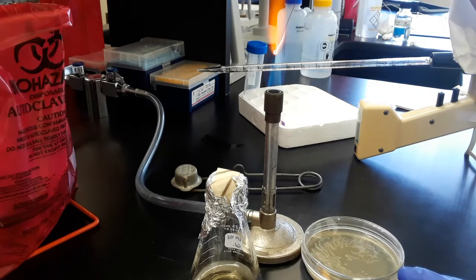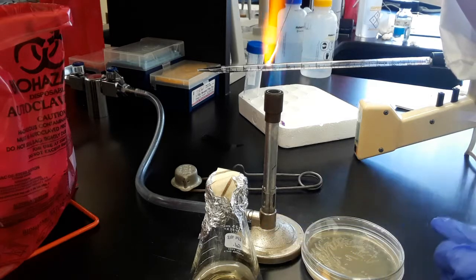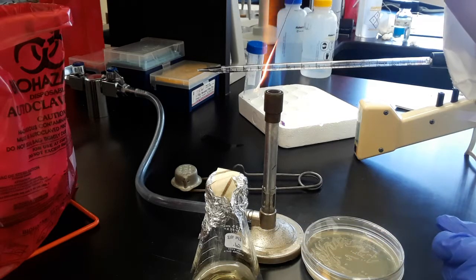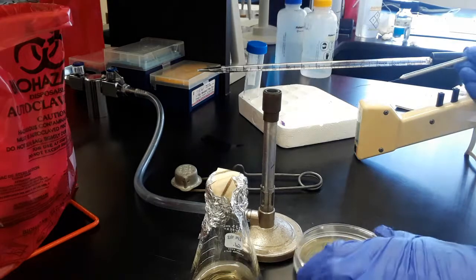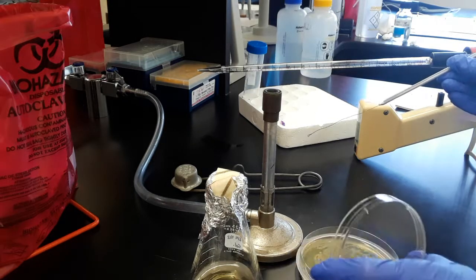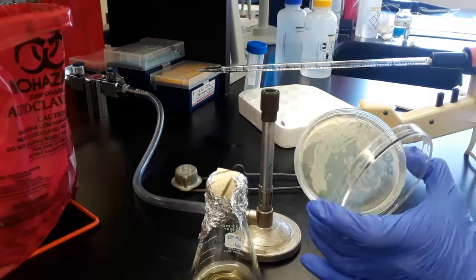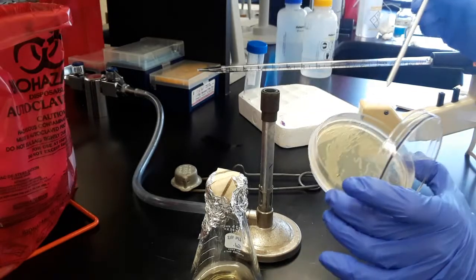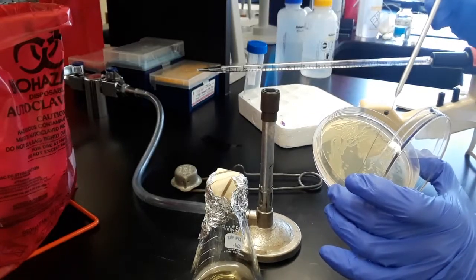What I'm going to do to inoculate this flask from this stock plate is just flame a loop to make sure it's sterile. I can touch it on the side here, away from colonies.